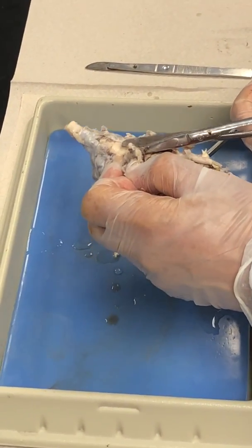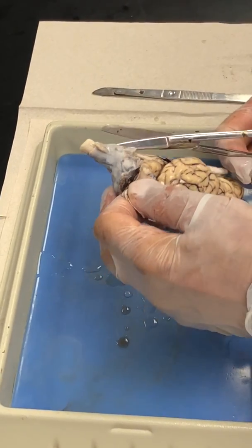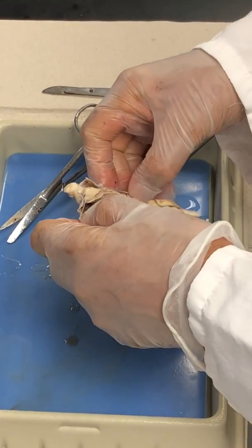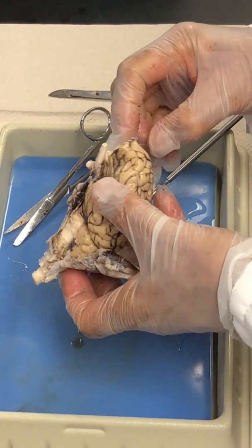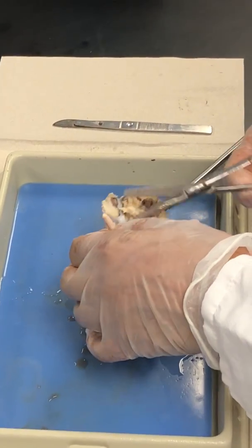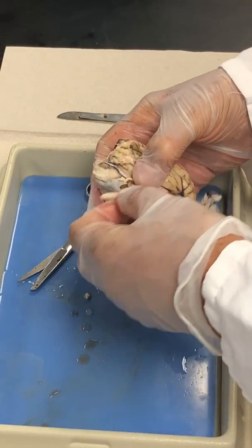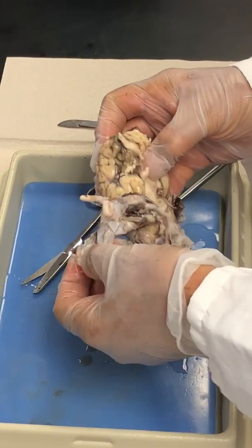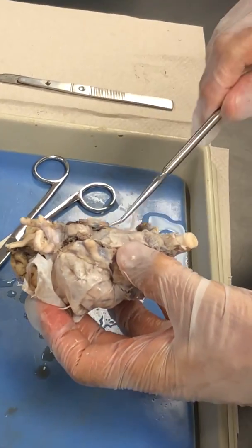All of this black is actually blood. So the pituitary gland, when I take the dura mater off, the pituitary gland is actually going to come off too. It'll be stuck to the dura mater. So that's the pituitary gland. Can you touch it again? The pituitary gland? Yeah, right there.